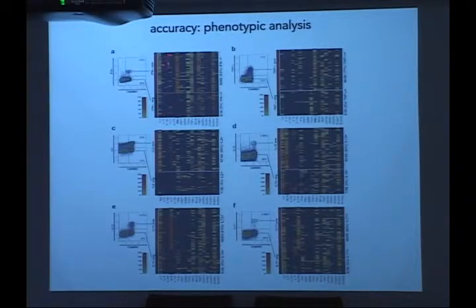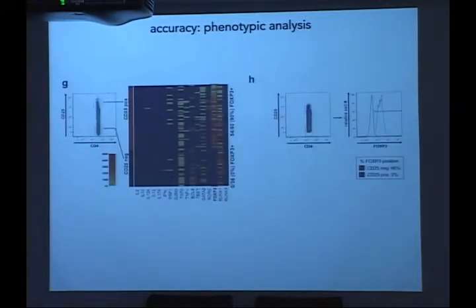And of course, not only, for instance, do you get interferon gamma, but we can get 17 other parameters as well, including transcription factors and all sorts of other cytokines. And in terms of transcription factors, people who have done staining for transcription factors know what a pain it is. So you actually need extra fixation steps to adequately quantify transcription factors.